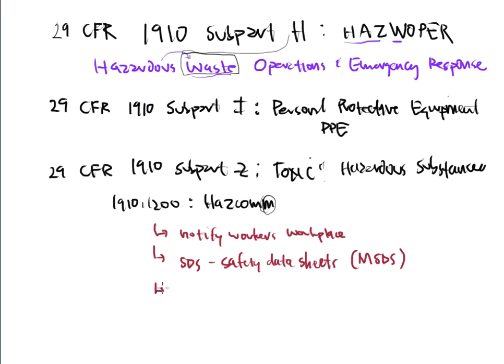And then chemical coding also goes under this section. So what are acids, what are bases, what are oxidizers, what are flammables, what are poisons? Those are the types of classifications that we have to think of, and we have to keep that in mind due to storage. Where do these chemicals get stored? All of this falls under the HAZCOM.